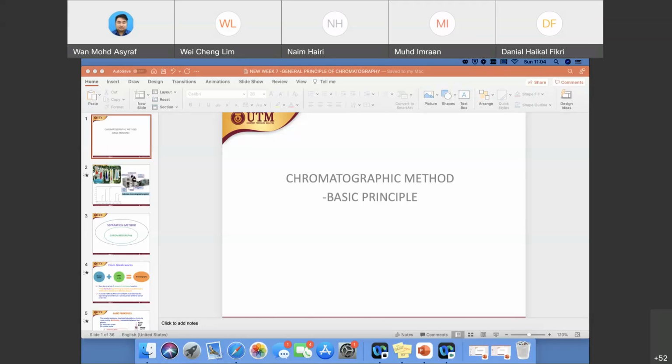So now chromatographic methods, or chromatographic instruments, are for the analysis of organic analytes, okay? So before this, when we looked into the sample preparation for inorganic analytes, we did, for example, dry ashing, and then we did digestion, where we destroy all of the organic analytes. At that time, the organic analytes were called interferences, because we wanted the inorganic analytes only. Okay, but now we are focusing on the organic analytes.